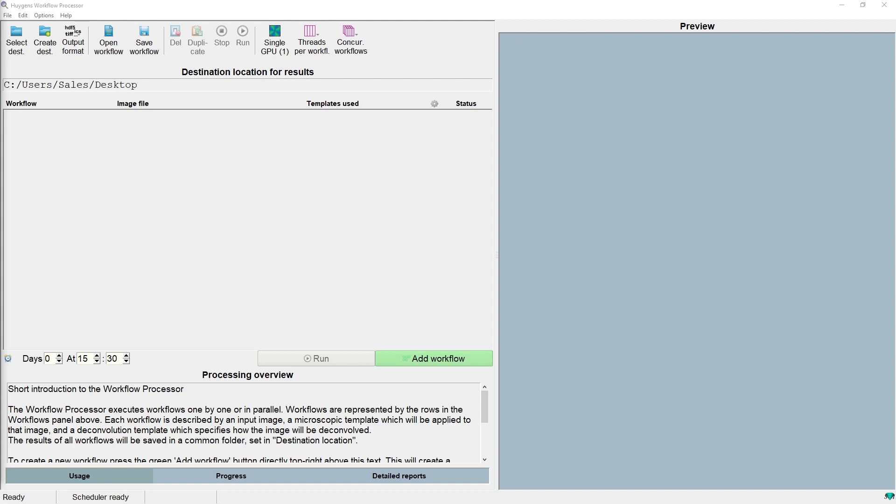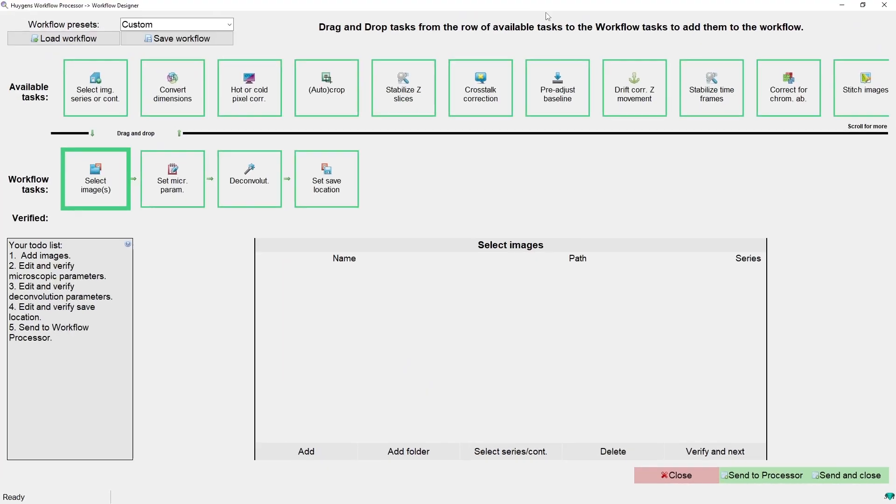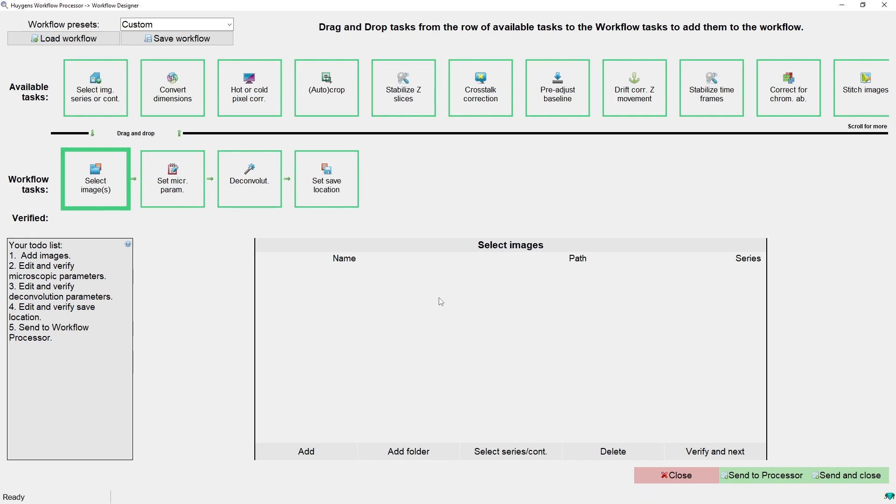Let's create a workflow by clicking the add workflow button in the workflow designer, and open the workflow designer. In the workflow designer we can create workflows for the workflow processor. We see two rows of icons that represent the various tasks you can process your image with. Below that is an editor for the currently selected task, and to the left of that is a to-do list with what you have to do before this workflow can be sent to the workflow processor.